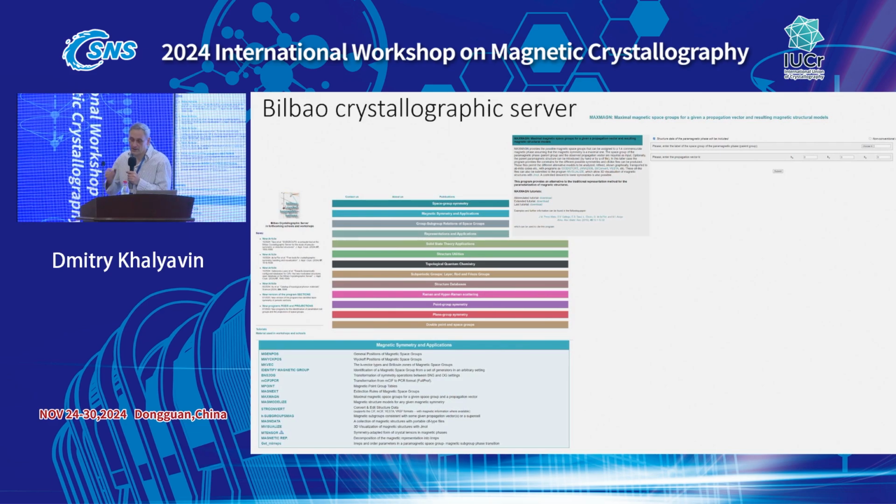And as Manuel Perez-Mato yesterday explained, it's always a good strategy to start looking at a solution from maximum isotropy subgroups. Because they are most likely, and there is a good reason why these solutions are most likely. It comes from Landau theory, the part of the theory that deals with a phase diagram which describes stability of different phases as a function in coordinates of phenomenological coefficients.